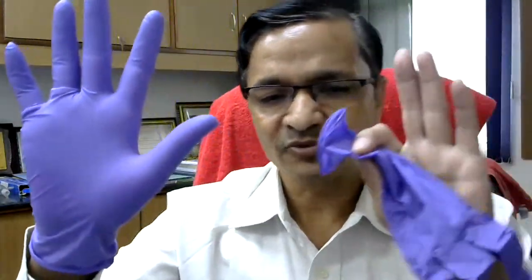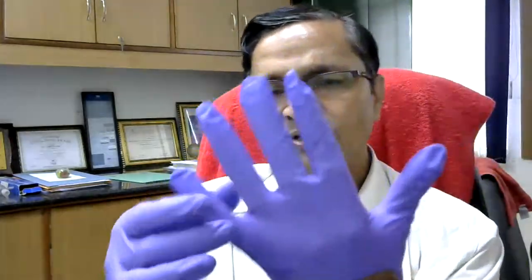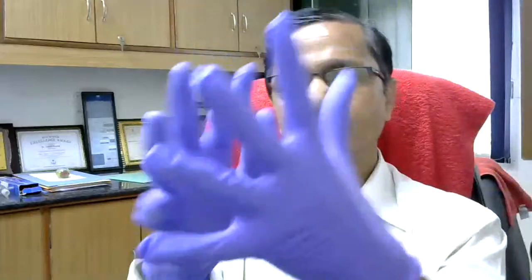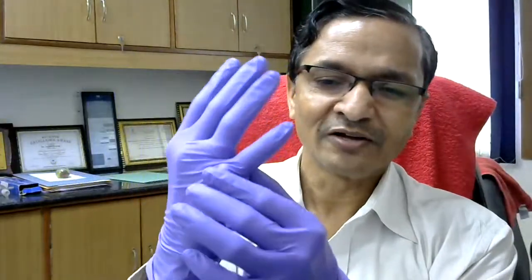So one hand glove is okay. Now I will try the second hand. Again I am putting all the fingers in here, and then like this. So the gloves are fitting here. Of course I am wearing rings, so that is why some obstructions are there.